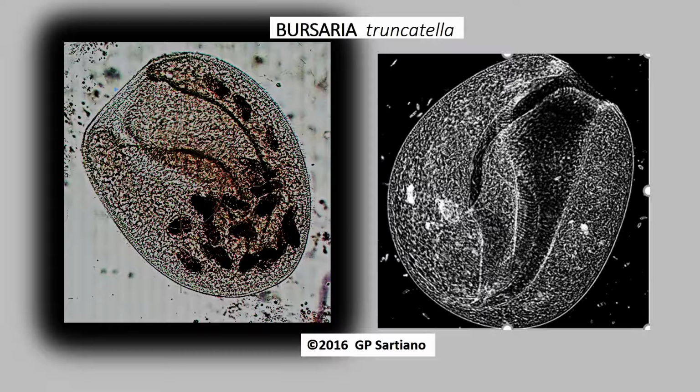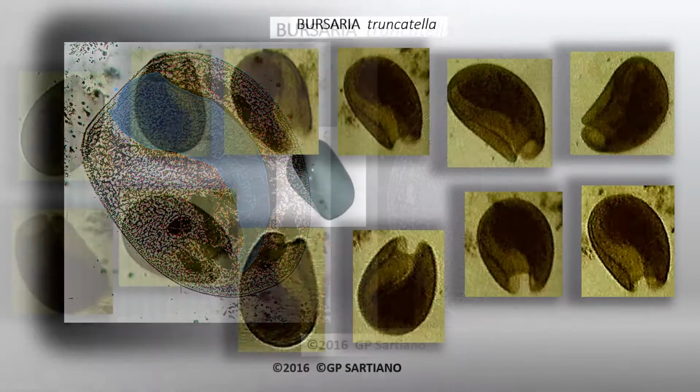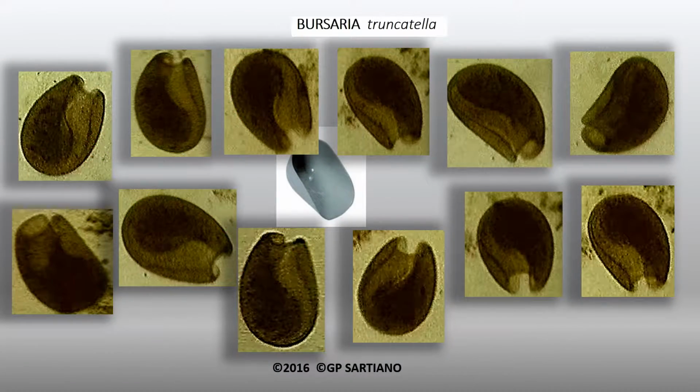The mouth opens into a deep, horn-shaped, large buccal cavity, a wide channel which extends downward more than halfway into the body of the organism, terminating at the cytopharyngeal entrance. On the ventral surface, the buccal channel is like a gaping open slit, giving the organism a scoop-like appearance.